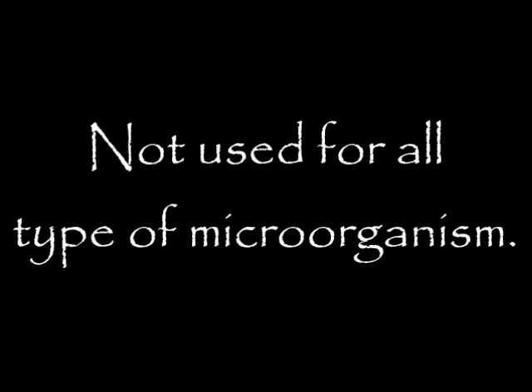What about its disadvantages? First, it is difficult to perform. Second, it needs a well-equipped laboratory for the preservation of the virus. This technique requires maintenance of biologically active phages and hence is available only at reference centers. Even for the experienced worker, the technique is demanding. And last, it is not used for all types of microorganisms because bacteriophage is highly specific to its host. Many strains are non-typable.